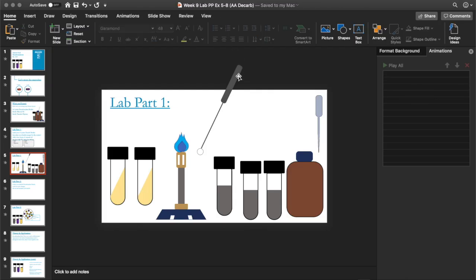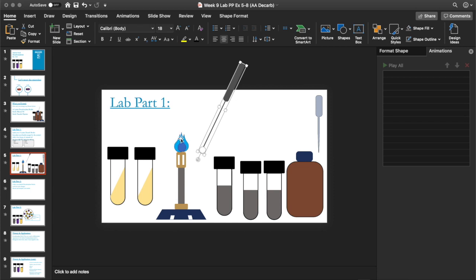Now that I've gone over the general outline of what you'll be doing for the lab portion, in this part, I just wanted to visually demonstrate what you'll be doing, just to help you guys get a better idea of what to expect. So of course, the first thing you want to do is grab your trusty inoculating loop, and I hope your Bunsen burner is turned on and the flame is properly set.